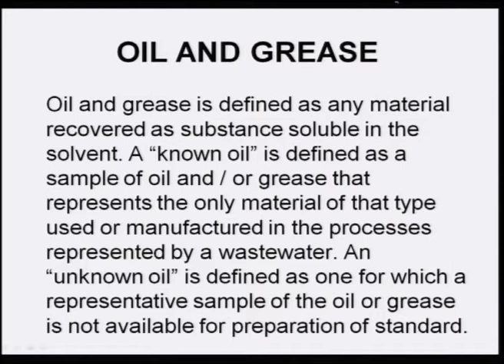An unknown oil is defined as one for which a representative sample of the oil or grease is not available for preparation of standard. So, sometimes it could be a known oil, that means there is an oil spill where you know that this type of oil was floating on the water, and sometimes it is unknown, but there is a protocol for testing of these oils and grease in water.